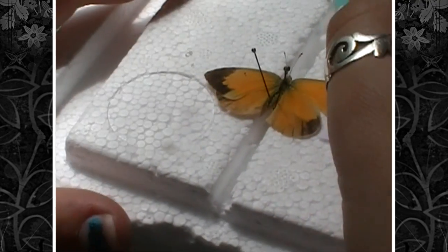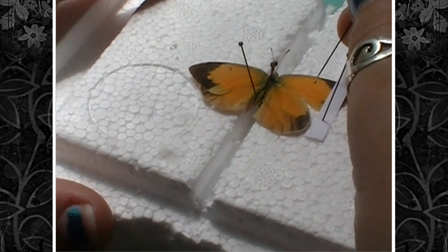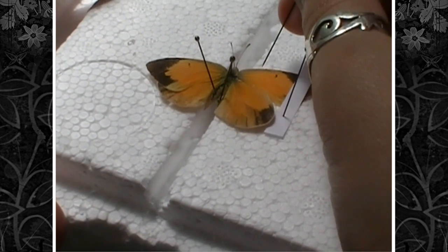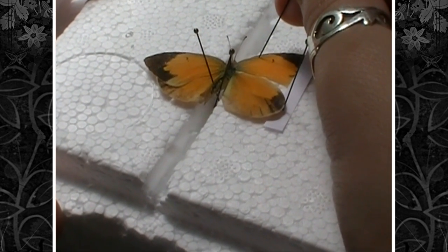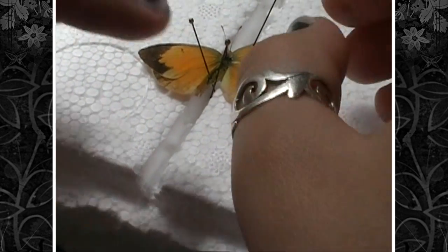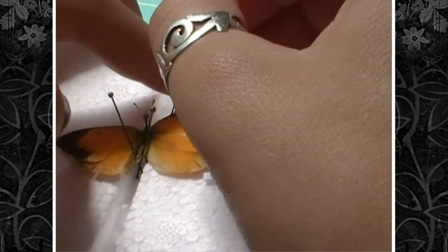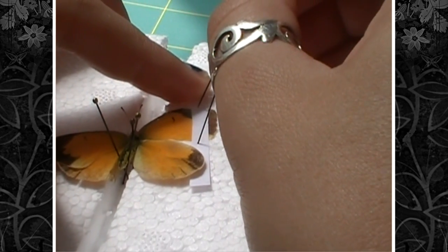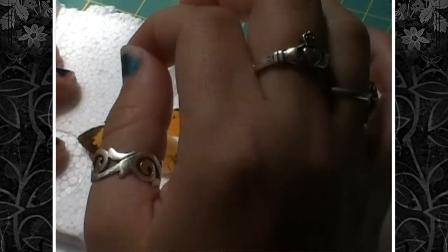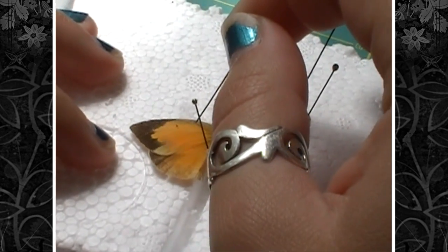Then you're going to take your pin and slide the wing up as far as you can possibly get it. This is really tricky because you're fighting against the wing muscles and trying not to rip the wing at the same time. Once you get it where you want it, gently push your pin down into the wing margin, move your other pin and piece of paper to the bottom of where the wing now is, and stick your first pin and piece of paper at the top. Then do the same thing for the other wing.